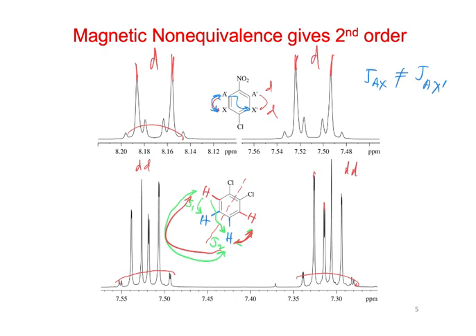Okay, so I guess the bottom line here, we know sometimes the peaks, especially in these aromatic systems, don't always come out as perfect as you might expect them to be. Contrary to what we were just talking about, whether all of our multiplets and stuff here are so perfect.